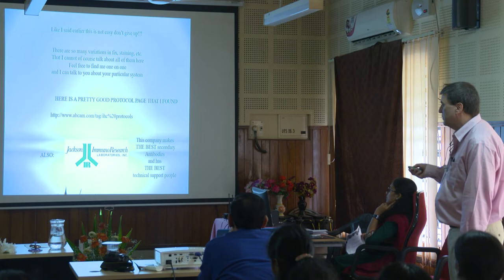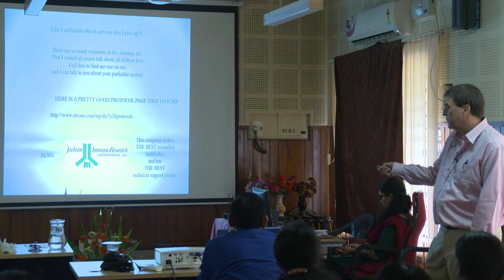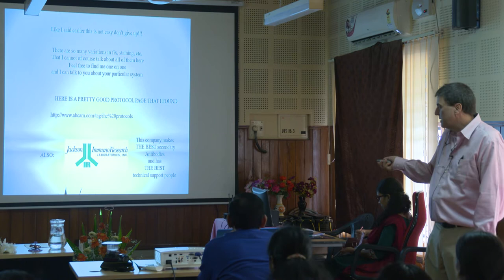Here's a pretty good page I found with some protocols. You'll have it in your PowerPoints. And the other thing is, when it comes to secondary antibodies, I don't play around. This company's the company, okay? They are the best. There's no doubt about it. And remember I said I was on that confocal listserv, with all the confocal people around the world. It's an agreement that they are a really good company and they seem to make the best secondaries.